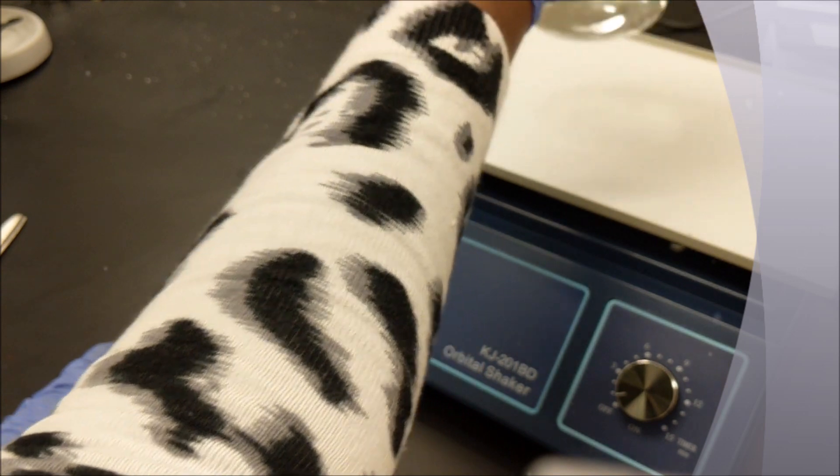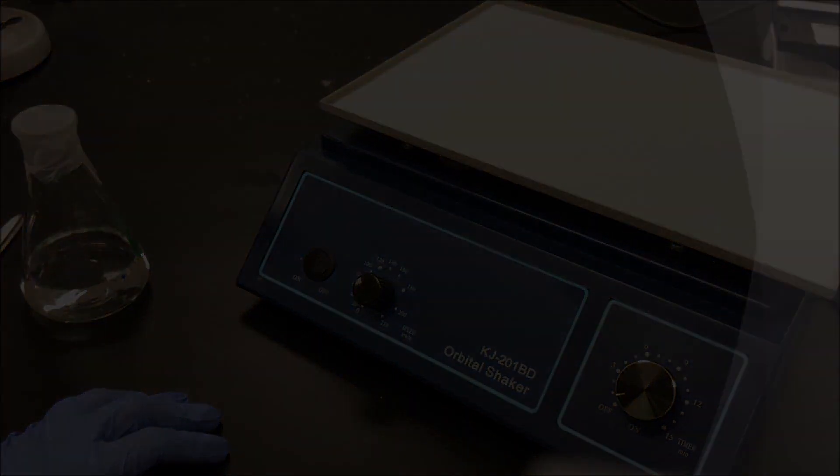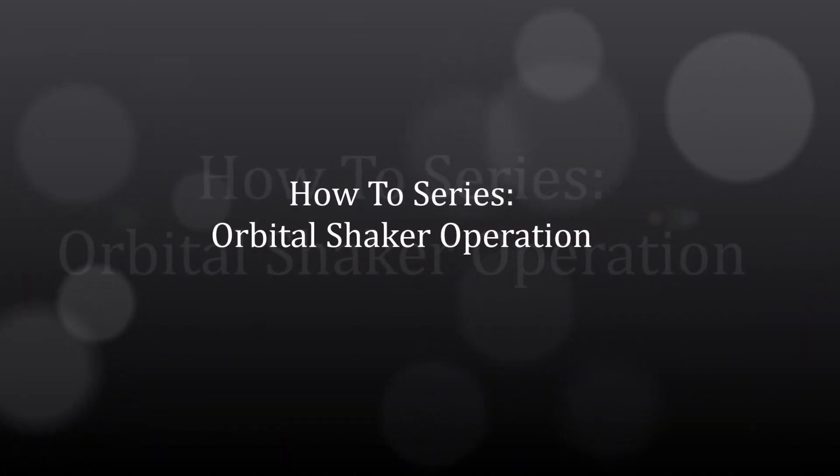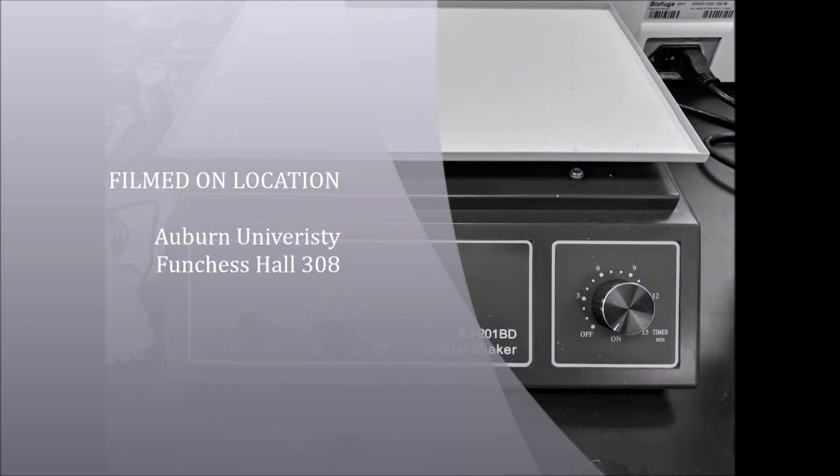When you're done, remove your sample or solution from the platform. Take care. Thank you.